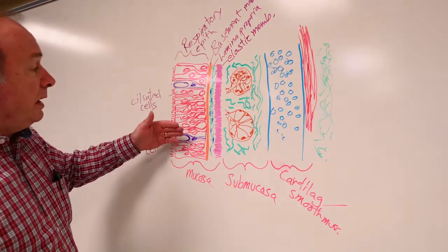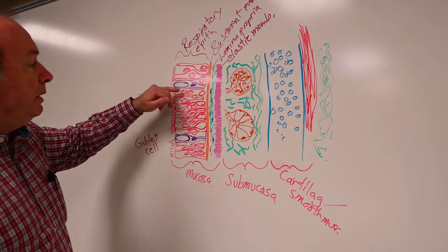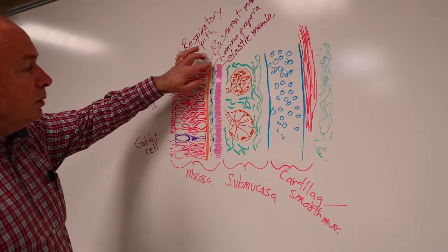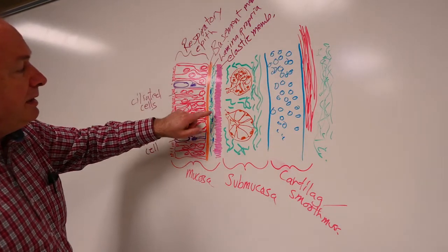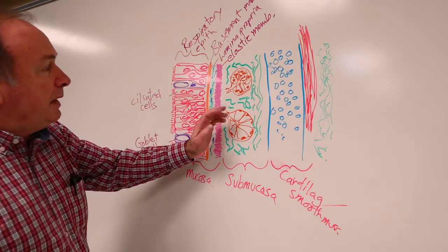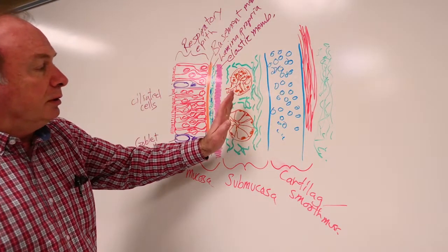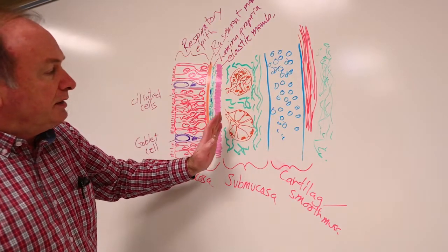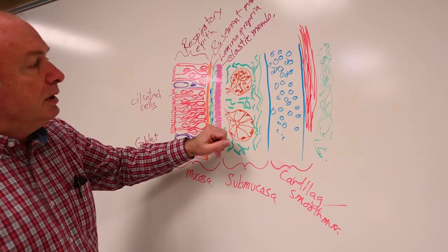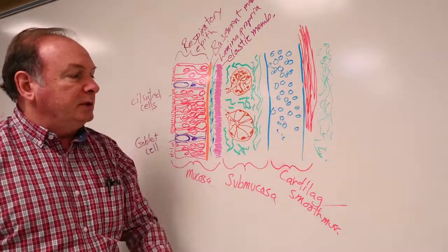We'll look at the epithelium. We'll look for cilia. We'll look for mucous goblets and mucous cells. We'll look at the pseudostratified tissue. We'll look for this elastic membrane in here and the little bit of lamina propria that lies between the epithelium and the elastic membrane. We'll look at submucosal tissues, composition there, see what kinds of tissues we see in there in addition to the serous and mucous glands and their ducts. Then we'll see some cartilage, we'll see some smooth muscle and adventitia.